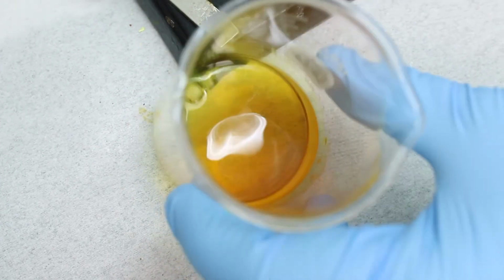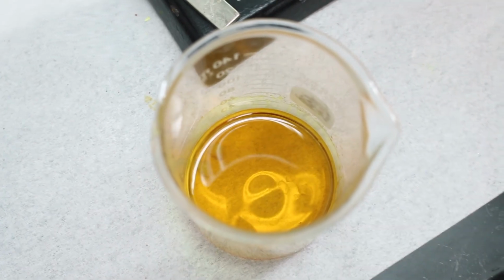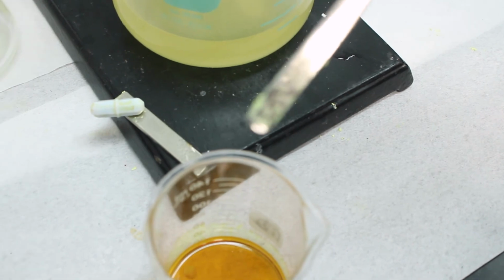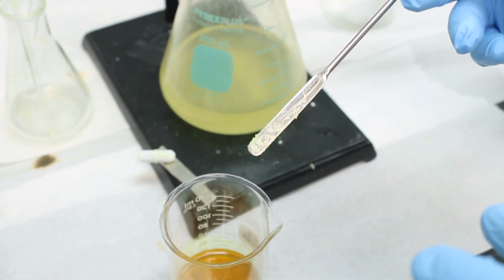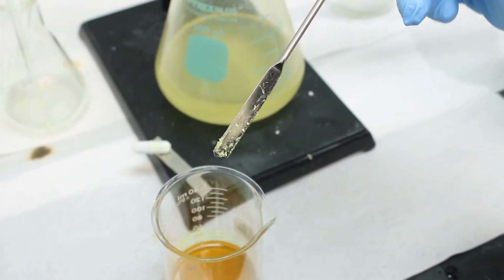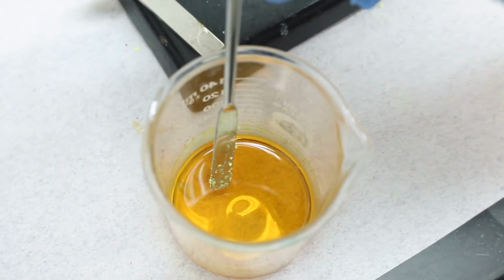So it looks like our boiling chips didn't work as well. We're going to try to seed it with a little bit of residue here, so you can see there's some solid. This is not the pure solid. It's the impure solid just on the spatula. So ideally you'd want to use a pure sample of this and put a small piece of that crystal. But you can try to temporarily, just briefly, dip this into the solution and it might cause it to crystallize.